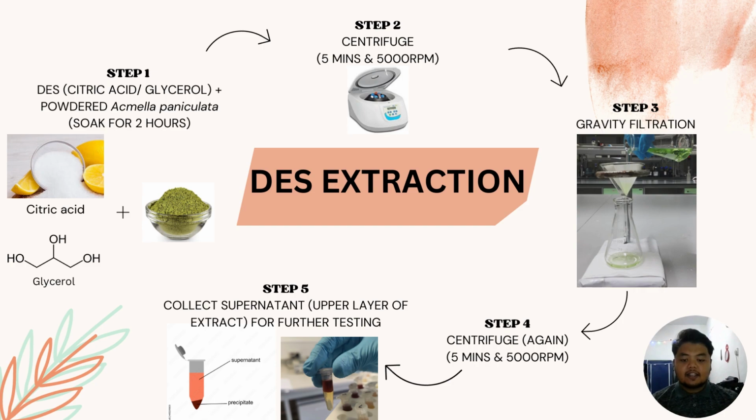So you can see in the picture that I provide, the upper layer is the supernatant that we use for the testing of our project.